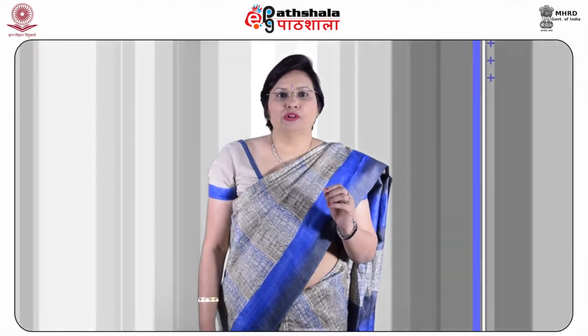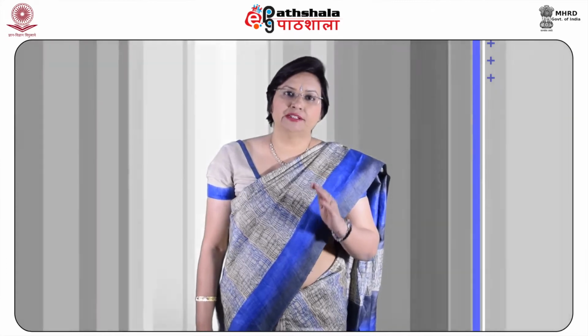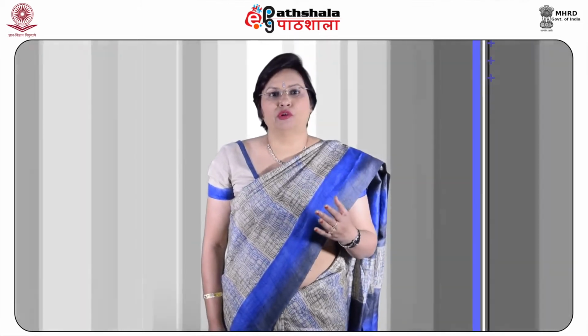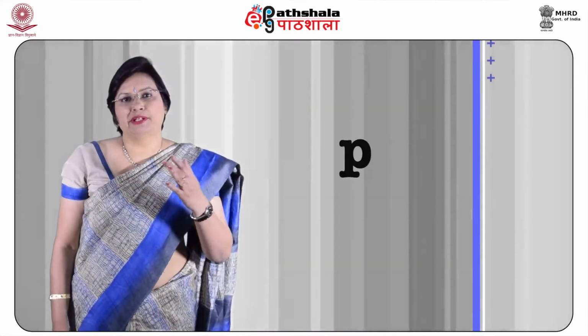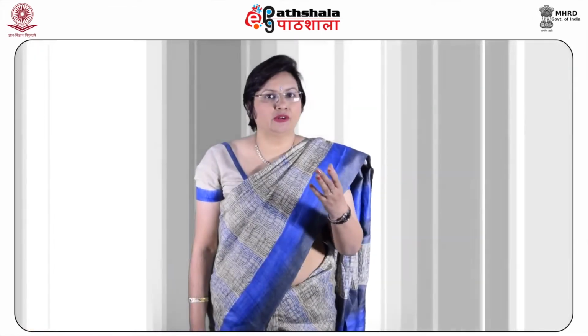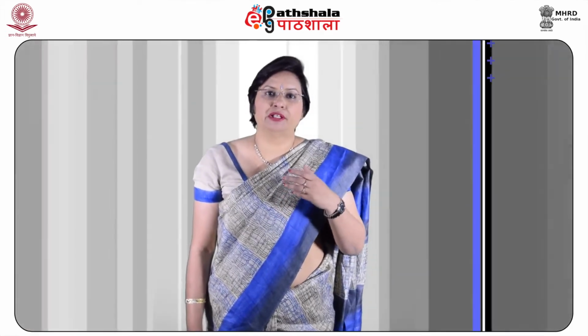In the previous module, you have studied some of the water quality parameters, and in this present module, you shall study a few more important parameters for determining the water quality for various end uses. So, let us begin with knowing more about pH. pH is not a new term to you, but let me revise.